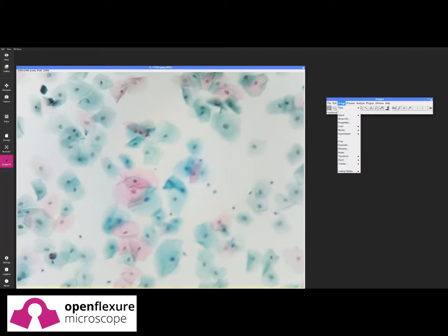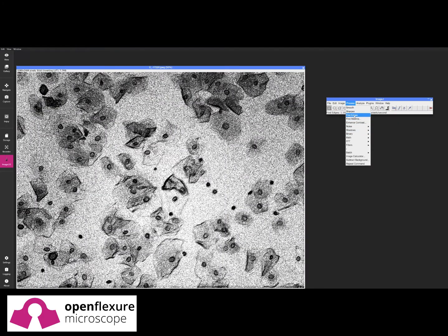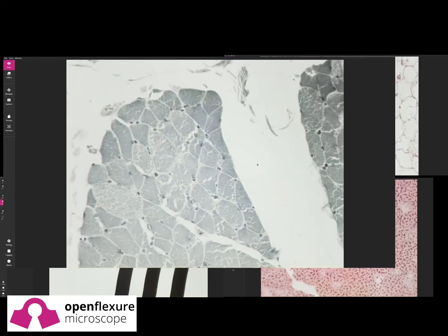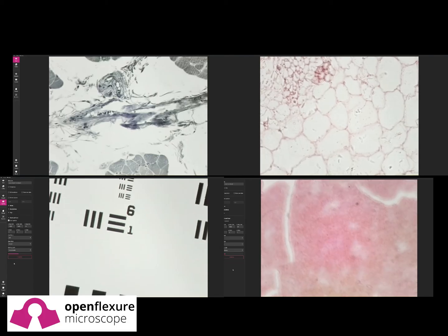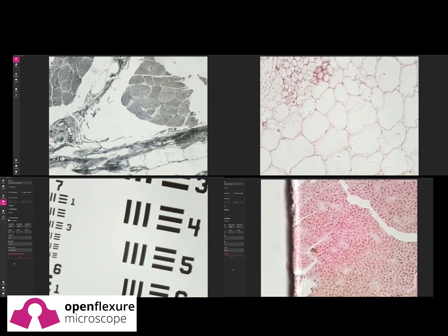This can also be the platform for low-resource artificial intelligence systems or automated image processing, making emerging technologies more accessible in low-resource settings. Free software to control the devices works with any number of OpenFlexure microscopes, enabling parallel scanning of samples. Images can be exported as a JPEG or PNG, so there are no restrictions tying anyone in to an expensive supplier.